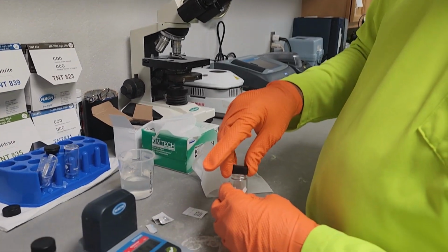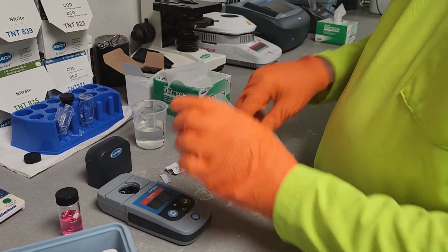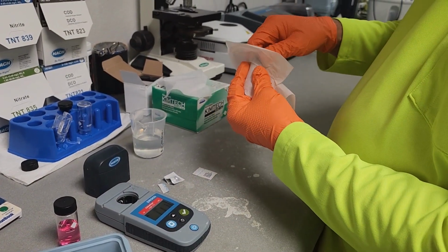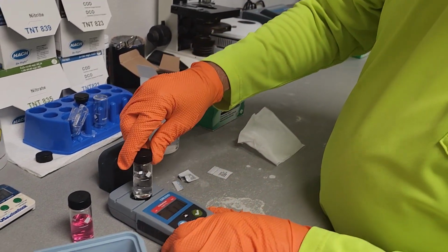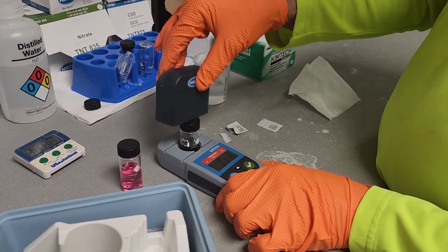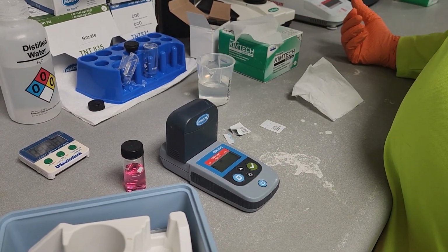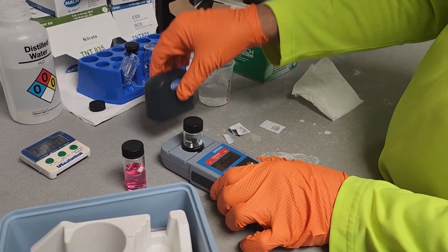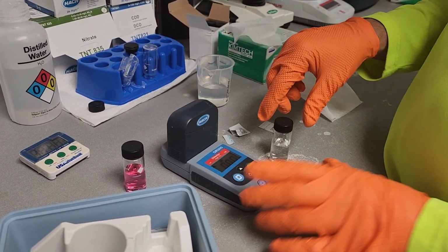Now, I'm going to go ahead and calibrate the meter again. Zero it out. Get that covered up.